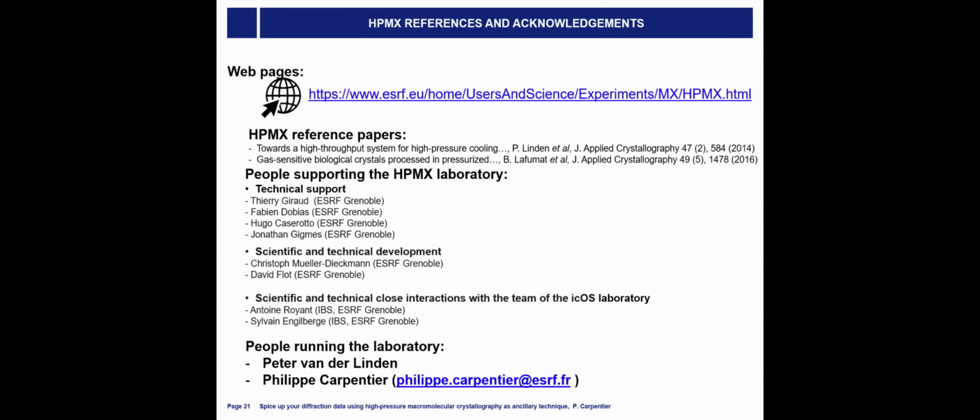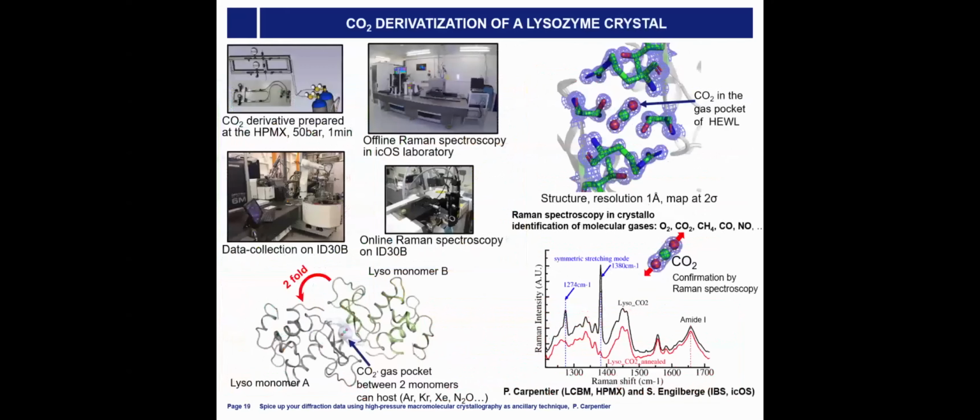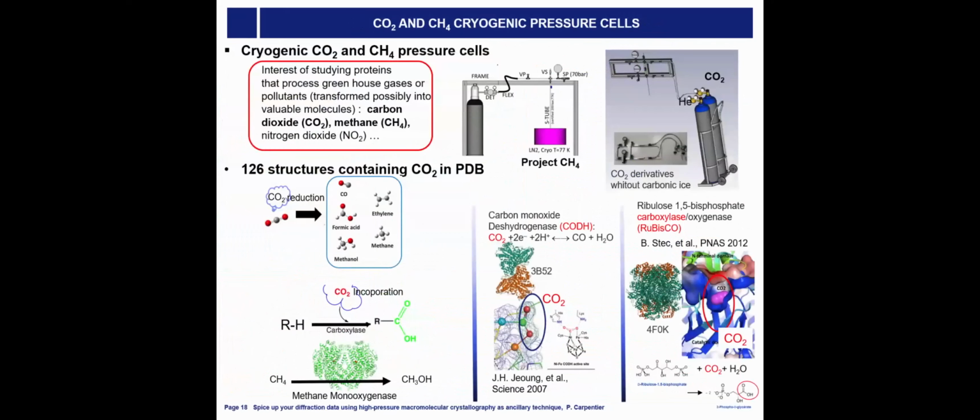about that. I don't know for the majority of the structures, but if you look at this one, it's an enzyme which processes CO2, and here I think there is a reaction between CO2 and the CODH, but I don't know. In general, it's an enzyme which processes CO2 and its interpretation of the reaction. I have to confess that I didn't look at this point here. But you can see here.